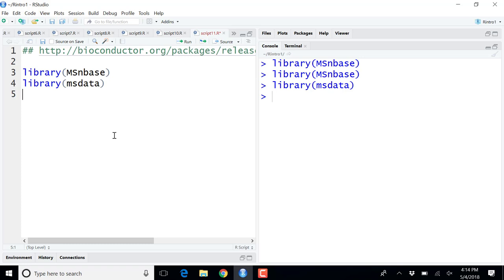For identification, they also have such a format, which is mzIdentML. And for quantitation, typically, the formats that have been developed by the communities are either mzTab or otherwise a spreadsheet. Proteome Discoverer, MaxQuant, probably any piece of software will allow you to export a table of proteins, samples, and probably additional annotation into a CSV file or similar.